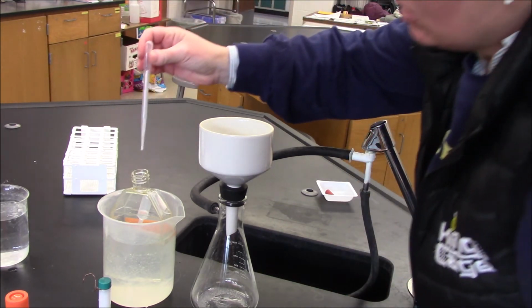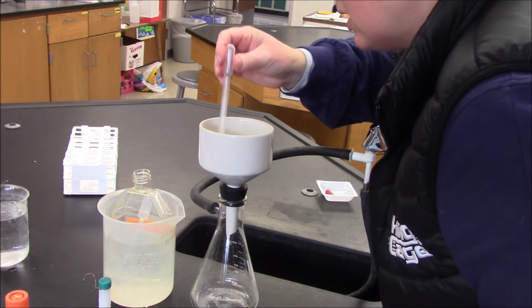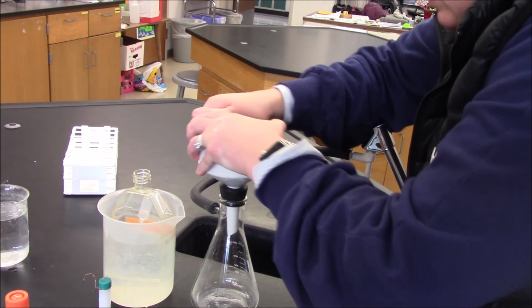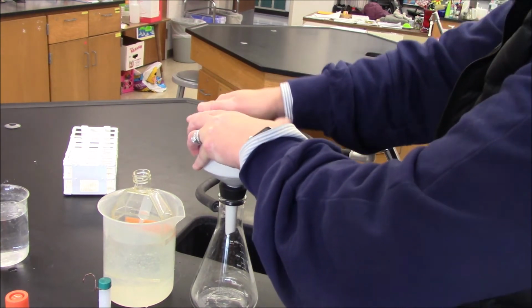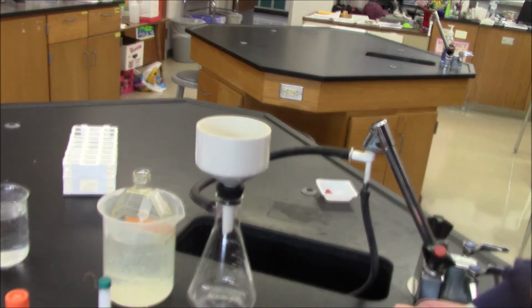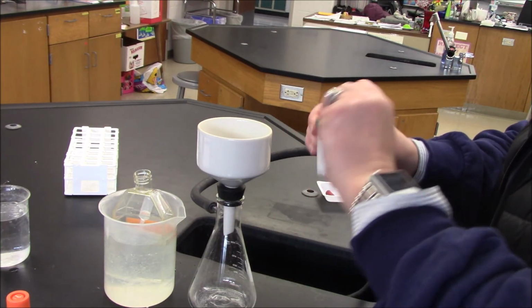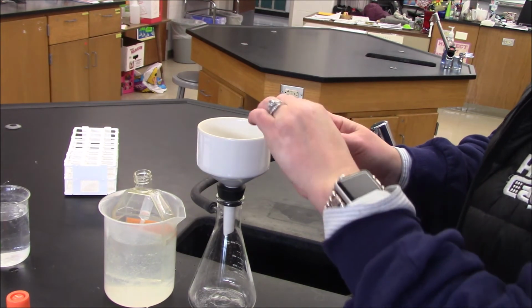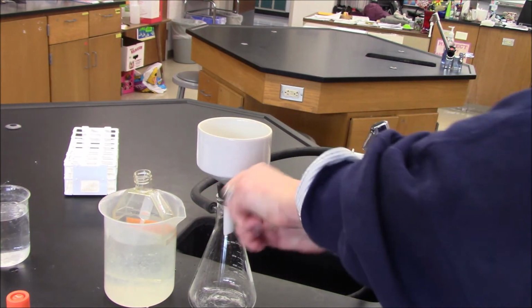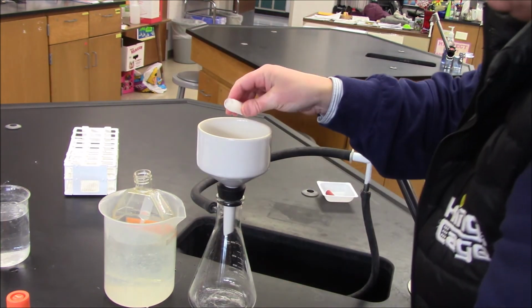Alright, I see some water starting to come through. Let's try a little more here. Let's see what I can get. Here we go. Alright, I think it looks pretty good in here. So now again, what I'm going to try and do is to get my product out of this reaction vial and into my filter.